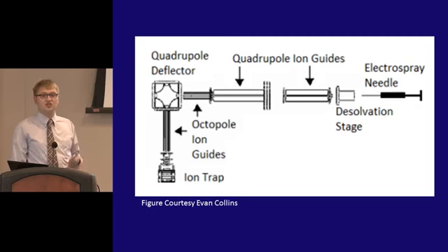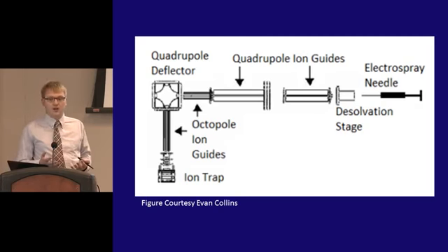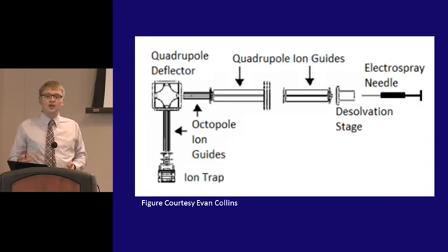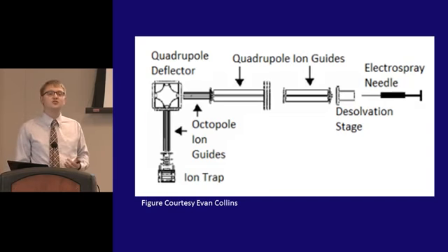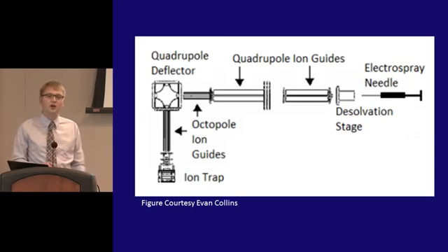Electrospray is a source that's continuous. It produces ions all the time, but at a weak rate. The ion trap allows us to accumulate all those anions and then release them all at once. We need this because our magnetic bottle spectrometer is intrinsically pulsed. It requires that it receive a bunch of ions all at once instead of a steady stream over time. So, how does an ion trap work?